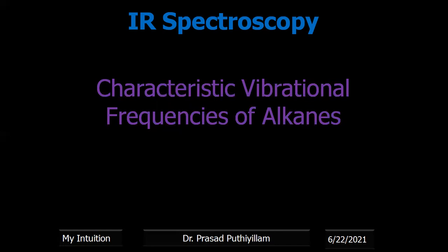Also, whatever unknown compound we synthesize as a new product, we have some rough idea what type of functional groups are present in it. Therefore, we can have a better analysis by comparing the IR spectra of such organic compounds. If it is purely unknown, then we have to do many trial and error methods, because we have seen many factors which affect the IR vibrations.